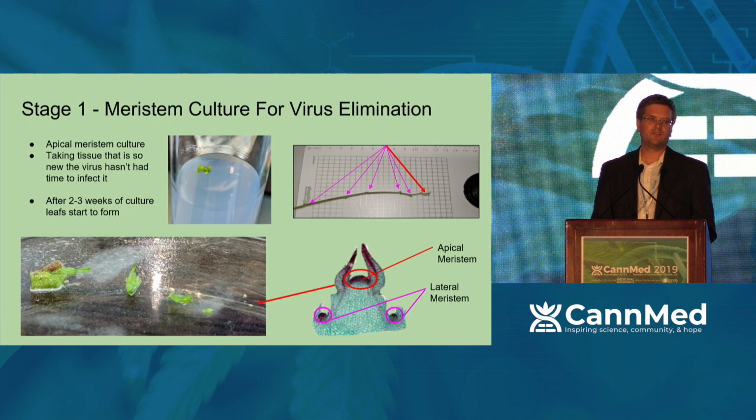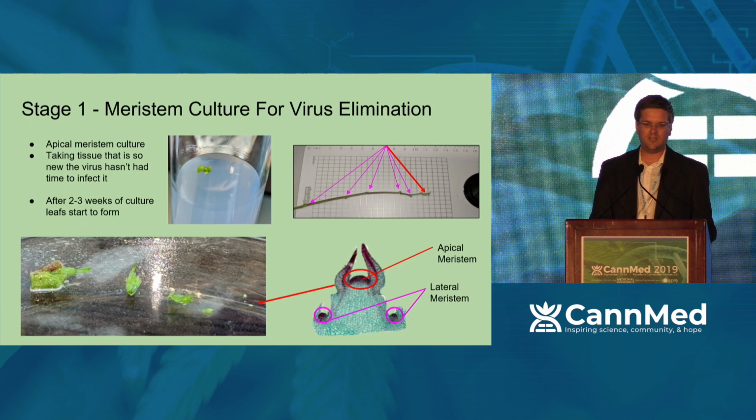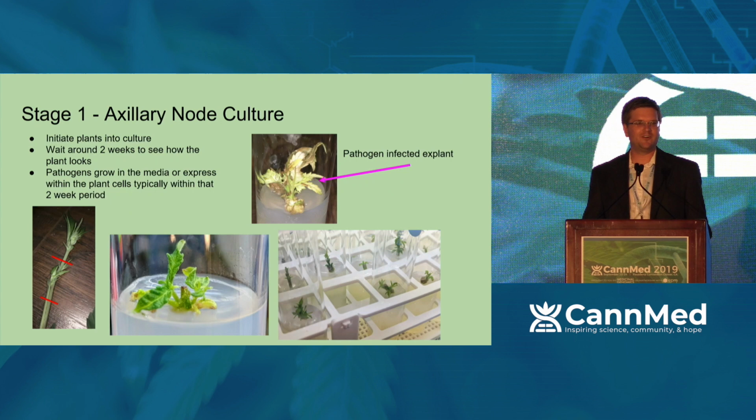If you take an apical meristem, that tissue can be so new, you can actually culture out of viruses. Yes, you can culture out of viruses. That does not guarantee the virus is going to be eliminated, because there's a good chance you had human error and you did not culture out of that virus. So that being said, you need to really look at, does your plant have a virus in the first place? If it doesn't, I would recommend axillary node culture. It's a hell of a lot easier to do.